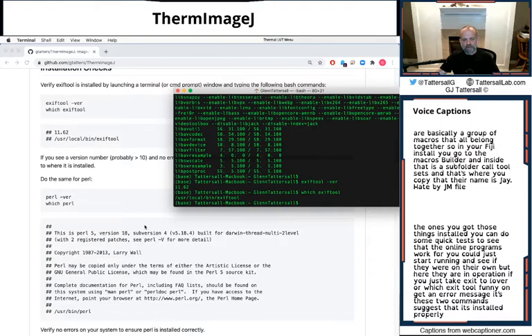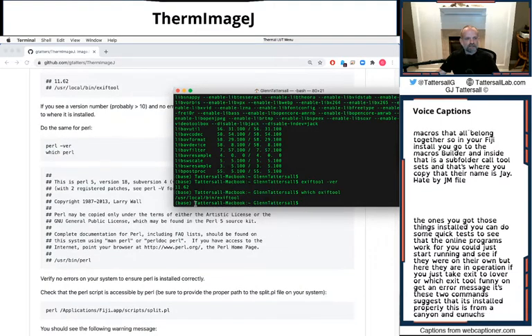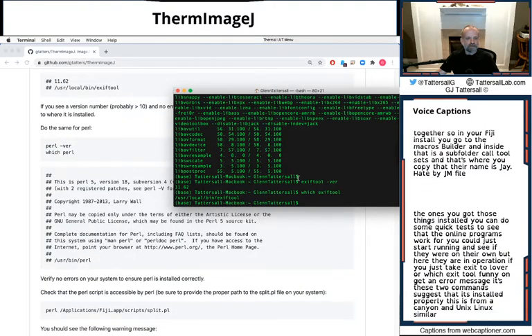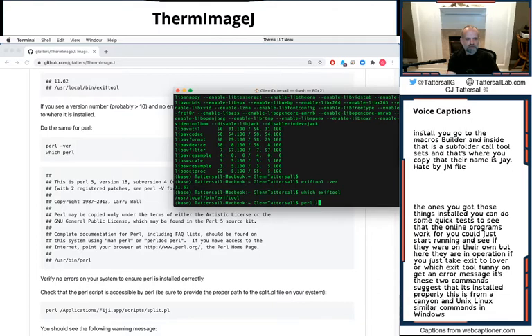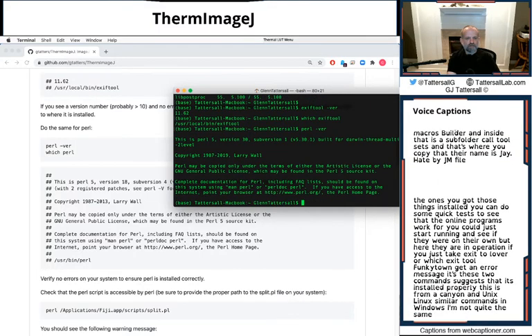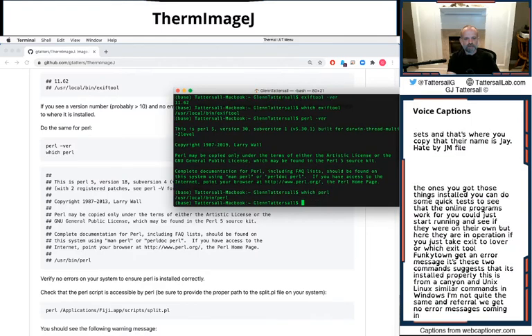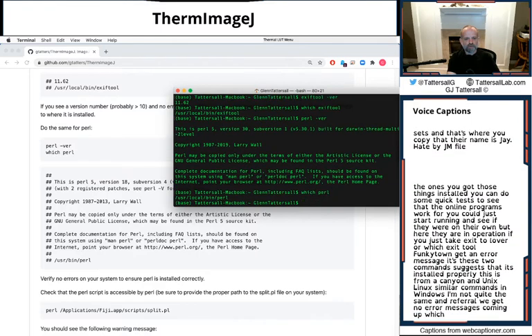This is for Mac and Unix, Linux. Similar commands in Windows. I'm not quite sure if they're the same. And for Perl, we get no error messages coming up and which Perl or -ver Perl give us feedback.